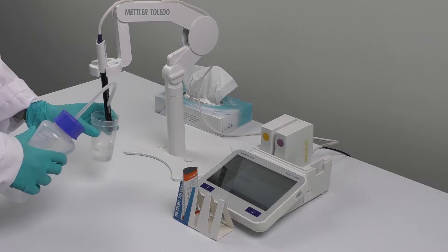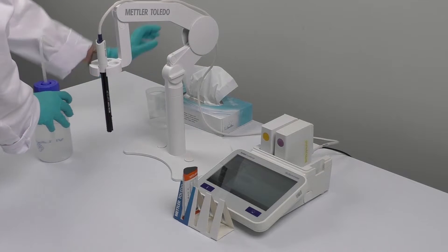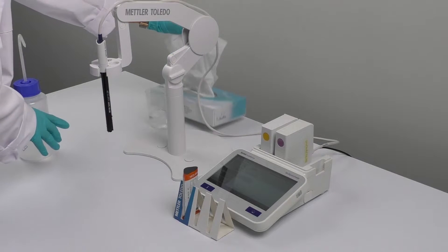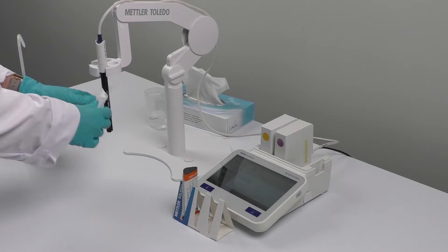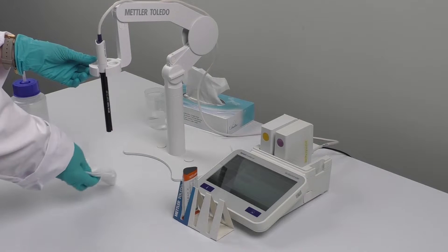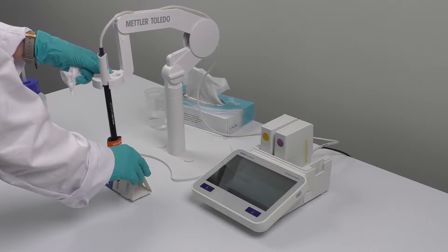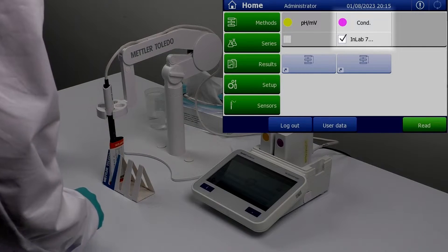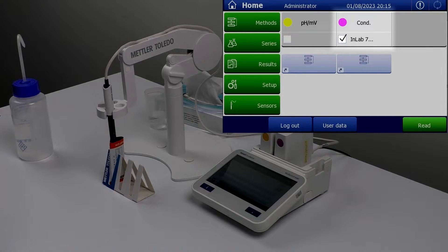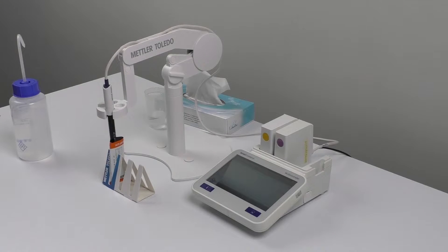Now rinse the sensor with deionized water and dab it with a tissue, then immerse the sensor into the conductivity standard. Next, select the conductivity module on 7 Excellence. Under the module settings, click on 'Calibrate' to start calibrating the sensor.